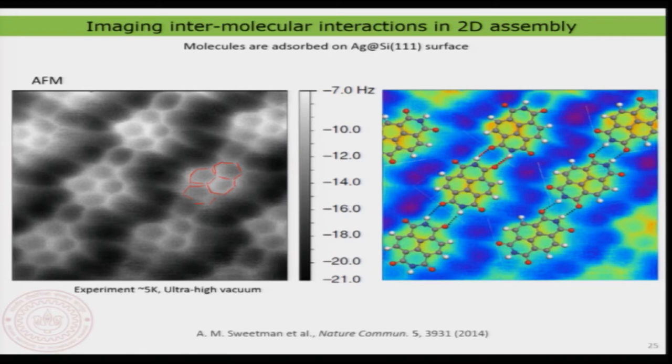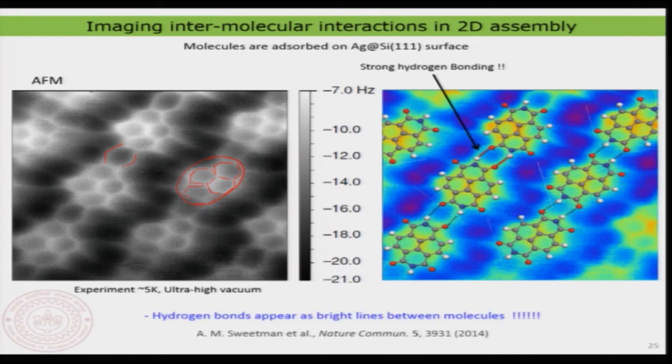But now something interesting you would also notice: you are not only seeing the molecules, you can also see something in between the molecules. Do you see this? What is that? Well, that is nothing but the hydrogen bonding. So for the first time ever, people could see the hydrogen bonding.